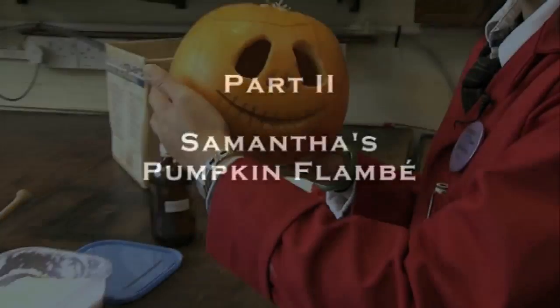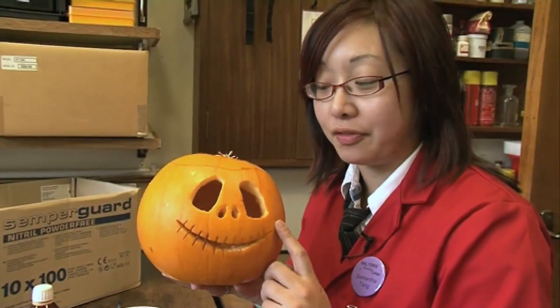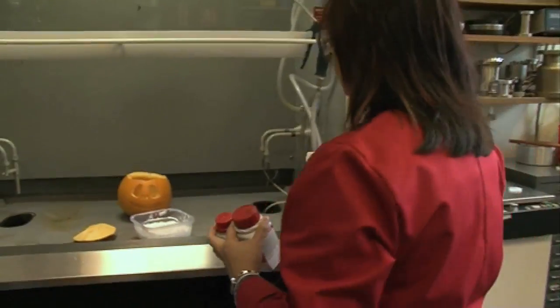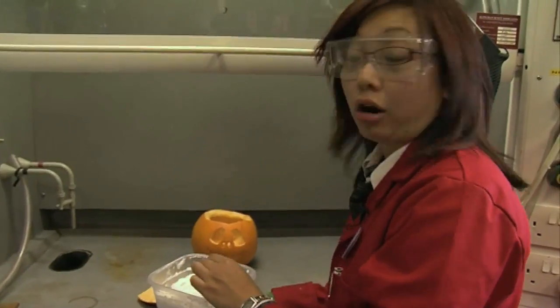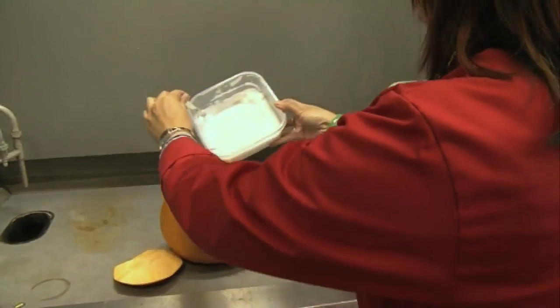For the Halloween special of Periodic Table videos, check out my pumpkin — I carved it myself, I quite like the design. What we're going to do is introduce the magic flammable substance, which is actually a gel made of calcium acetate and an alcohol, ethanol. Let's slop it in.